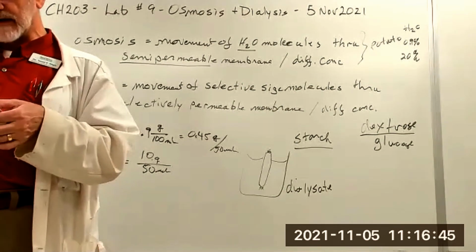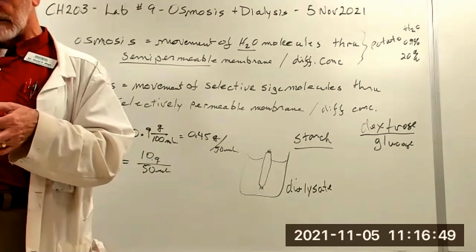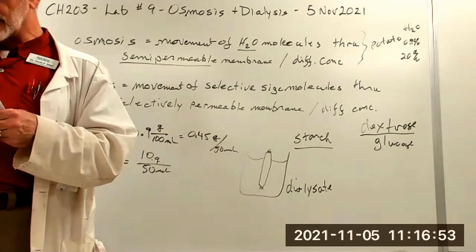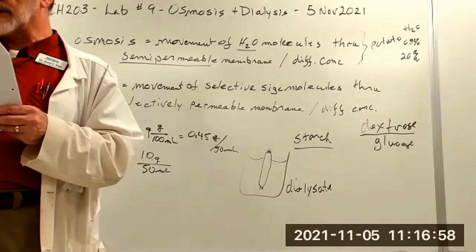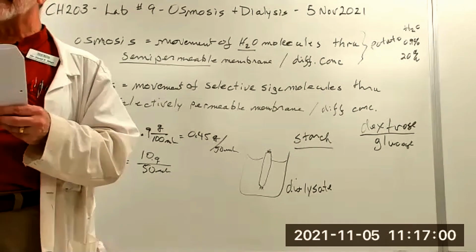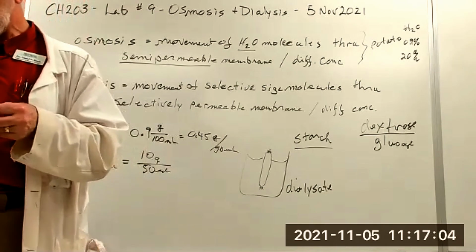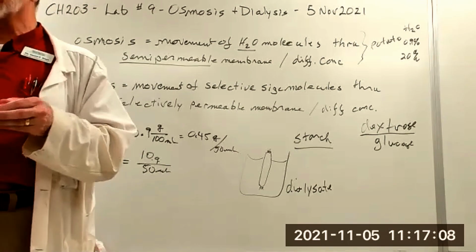Oh, it does test the Benedict with the solution inside the tubing. Okay, so you're going to do 4 tests. You're going to give a solution before it heats, solution after it heats, and then you're going to say, is glucose present? So that's just a checkbox, whether it's present or absent. And the same thing with iodine, except iodine you don't have to heat, so it's a simpler test.